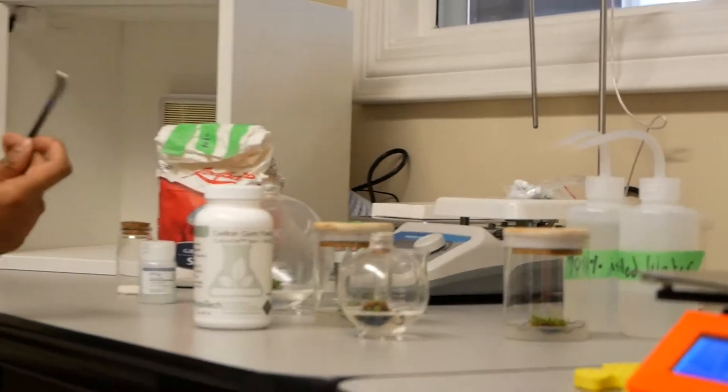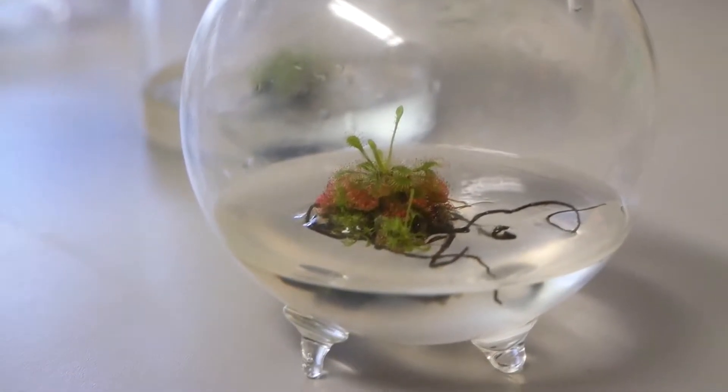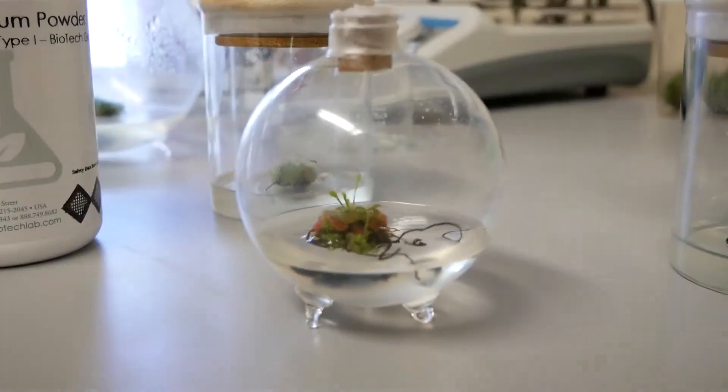We sterilized all the equipment we used, then transferred the plants, and sealed it with wax paper so no contamination could get in. I have noticed a little bit of growth in them — I believe these stems at the top weren't there when we started, and I'm tracking them currently.